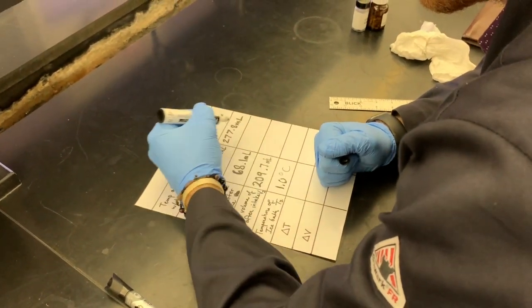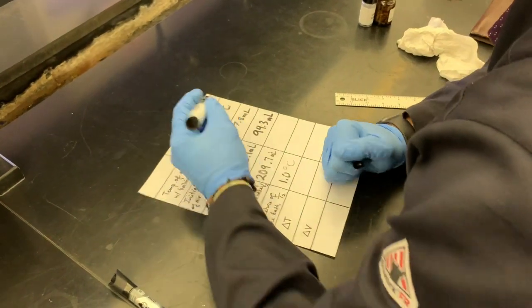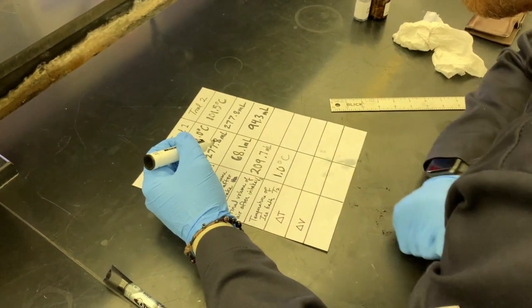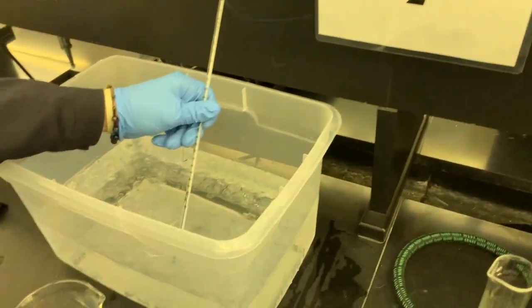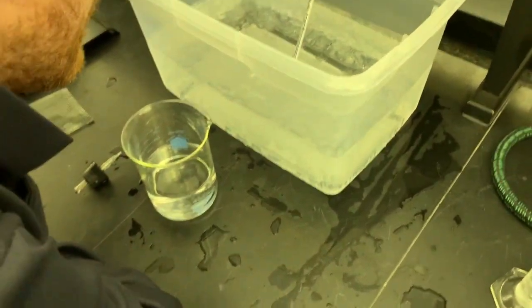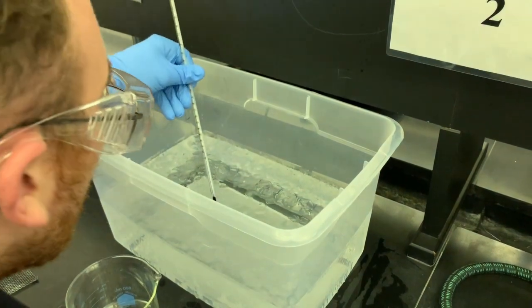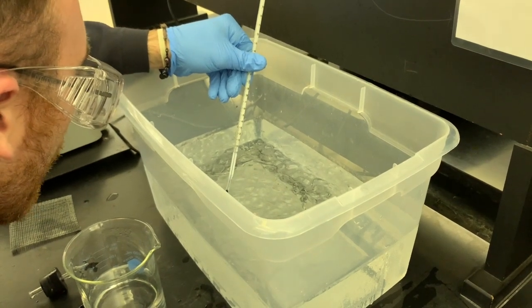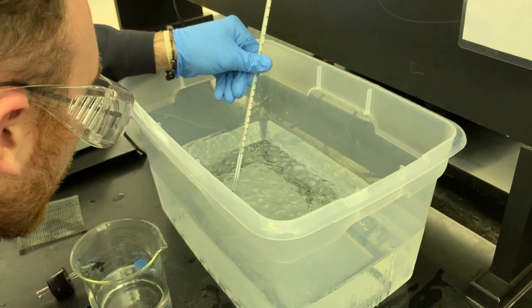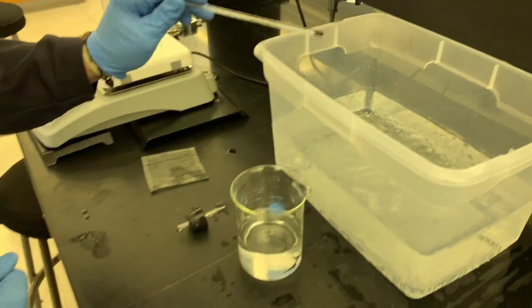Okay, 94.3 milliliters. And when you look at the initial temperature, the nice thing about this part is you can always go back and double check, which I will. Never hurts. I'm going to take a second though, and see if we're still hovering around 1.8, 1.9. Oh yeah, we're even down to about 1 even actually, 1.0 degrees Celsius. That's what a little stirring can do.